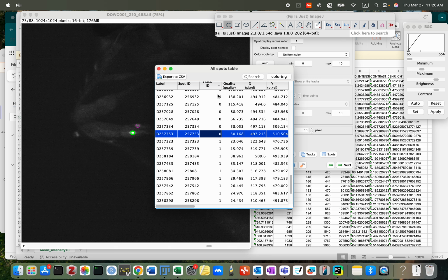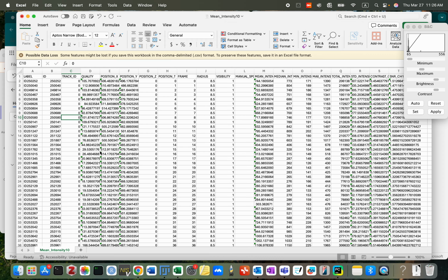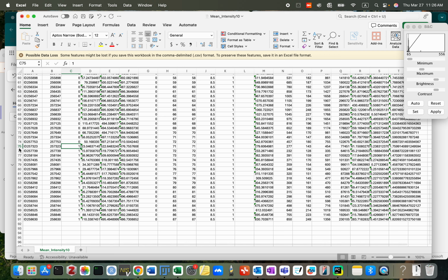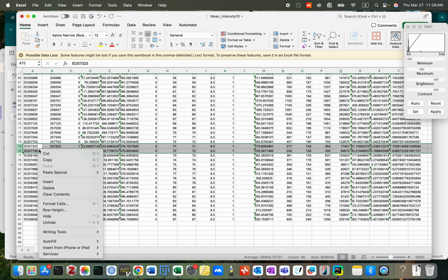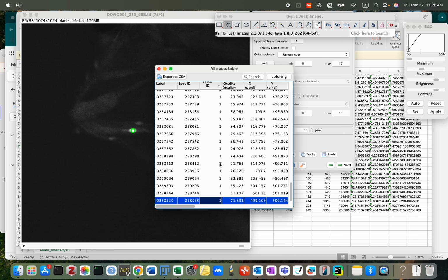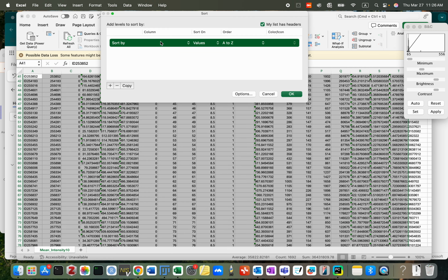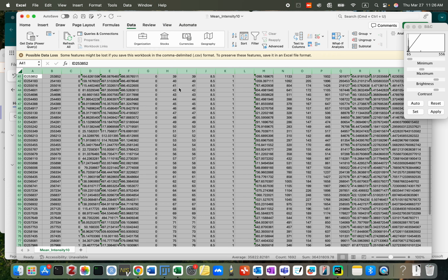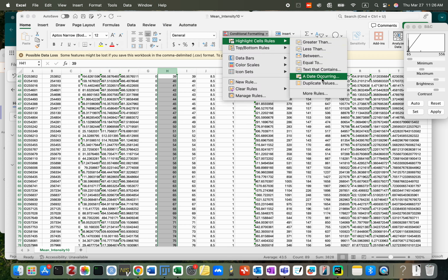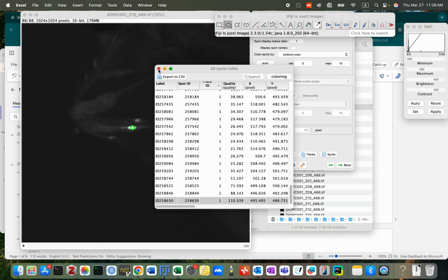Okay, something wrong here from the first of checking ID number 1 to first 2. We need to delete. Find ID number 1, first 2. Delete. Okay. Oh, the other checking ID was number 1. That's correct. Because we have 2 checking IDs, again I need to do sorting based on position T and duplicates. No duplicates, save. Then with this stack for neuron 1.